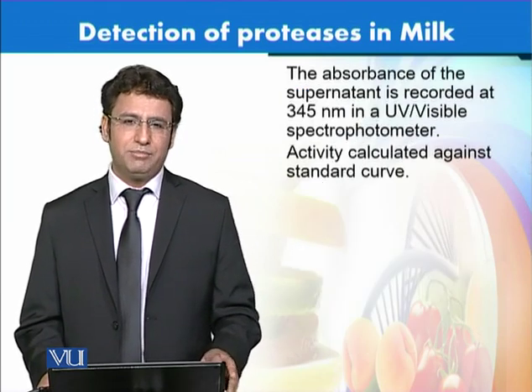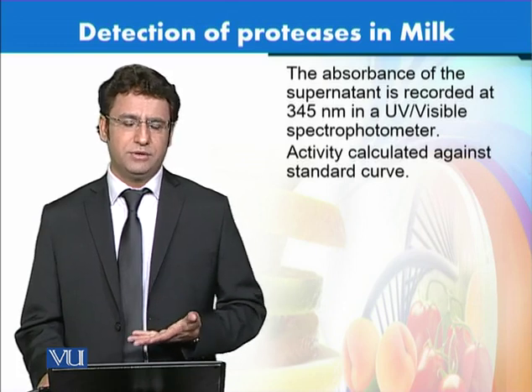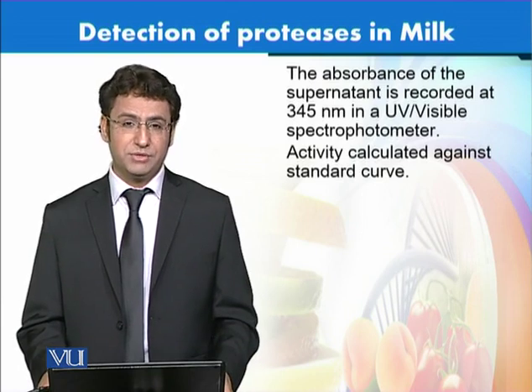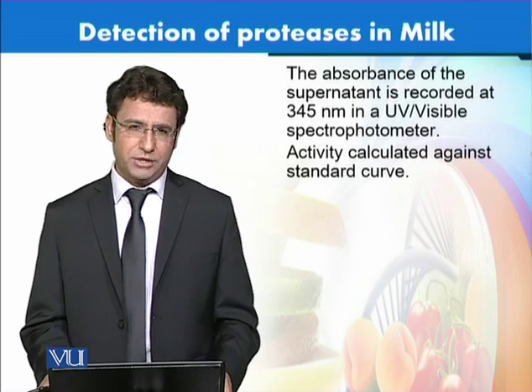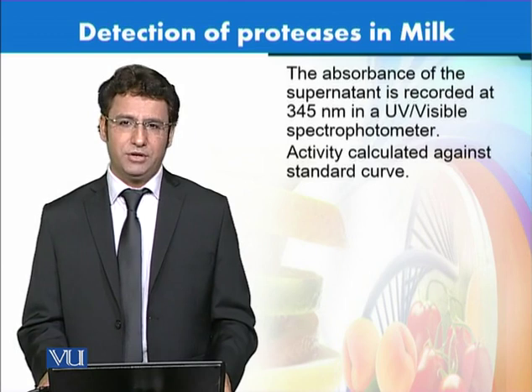In the last step, we take the supernatant fluid and measure it with a UV spectrophotometer, at an absorbance wavelength of 345 nanometers.